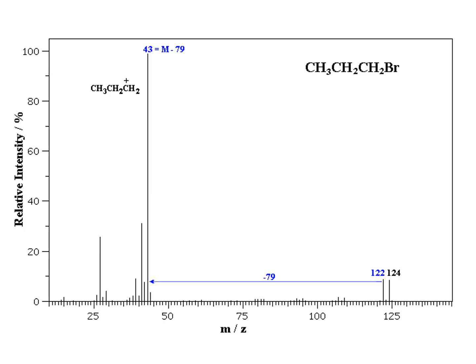So when we represent our fragments, note how that is represented. The structure is drawn such that the carbon where the bromine was lost now has a positive charge. So the fragment is CH3, CH2, CH2 with the positive charge, because that last carbon is where the bromine was lost. Again, when we look at the other peaks, we may see some significant peaks, but for the sake of our examples right now, it may not be worth our time to go into more detail about what they are.